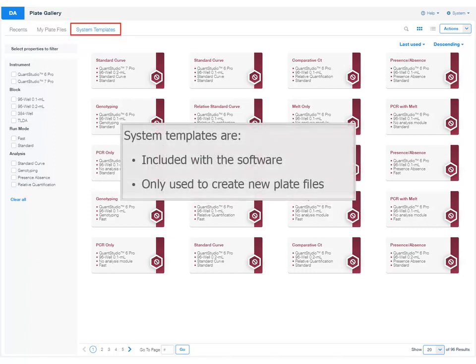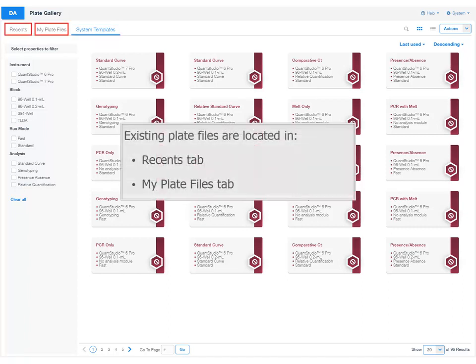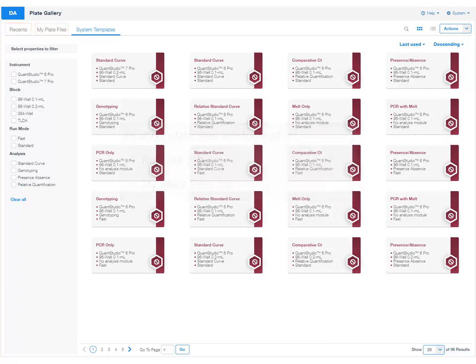System templates are included with the software and are only used to create new plate files. Existing plate files are located in the Recents or My Plate Files tabs. After you save a plate file, it can be added to My Plate Files for reuse. In this tutorial, we will create a new plate file using a system template.